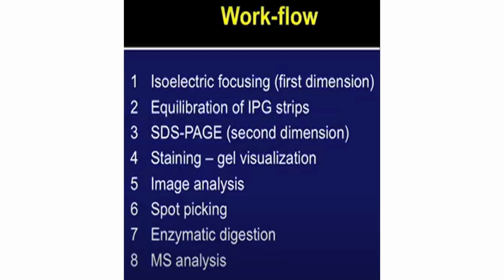relevant to your type of analysis, you can just cut that gel, then cut the protein fraction present on the gel, take it, do enzymatic digestion, and give it for mass spectrometry analysis. That protein will have a certain molecular weight. It will get ionized. Then, depending upon the mass to charge ratio, m by z ratio, it will get separated. The mass analyzer will analyze the mass, and you can determine whether your protein of interest was actually there or not. It will further confirm using mass spec analysis.